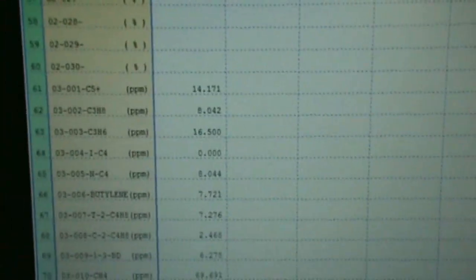All right, and this bottle must not have IC4. We had old bottles that didn't have IC4 in it. So I'll just live with that for right this second. But you can see we ran a 14, an 8, 16, 5. We got a 0 there. We would need to check our gates and calibrate the way I just talked to you about, response factor. All right, time out for 1 second.